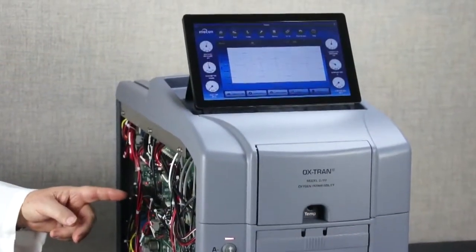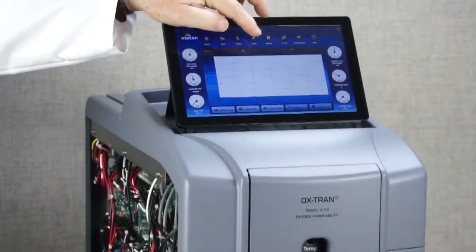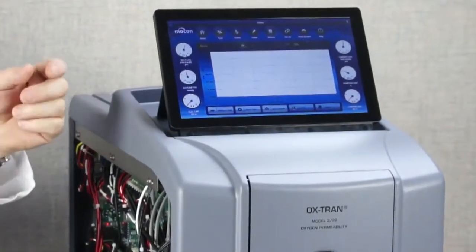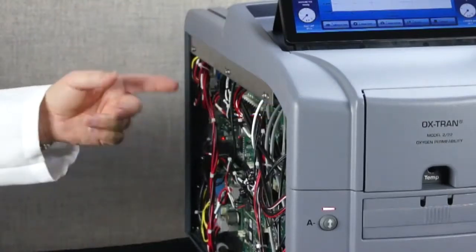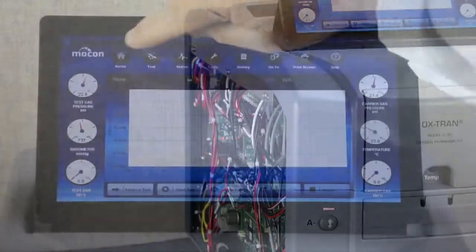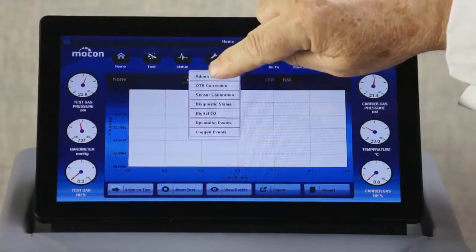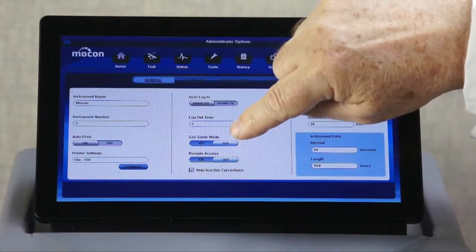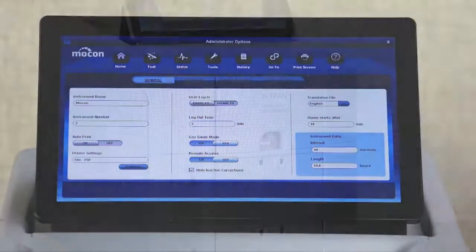Up to 100 tests will automatically be saved to the onboard hard drive. You can access these via the History menu, where you can sort, select, delete, and export. Just one part of the reduction in cost of ownership is the built-in circuit board protects against a current surge. Additional reduction in cost of operation will be gained via gas saver. When the instrument is in idle mode, the amount of gas flowing through the system is reduced by half, resulting in a substantial gas cost saving.